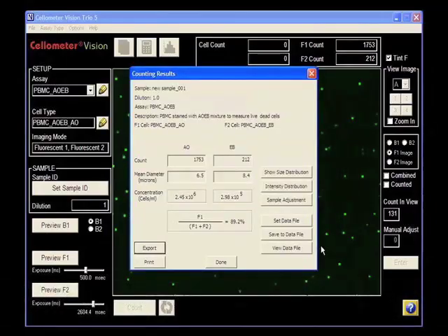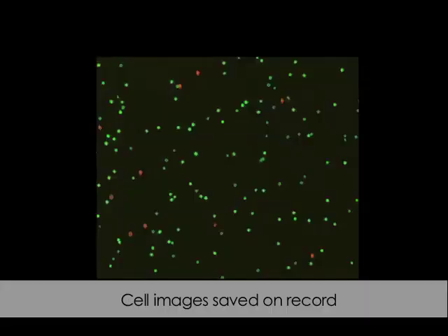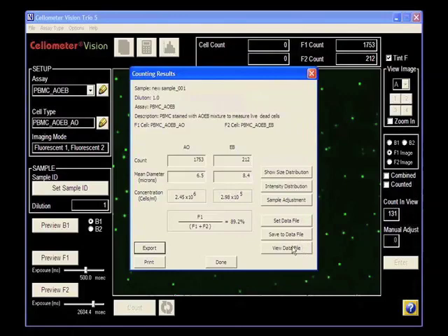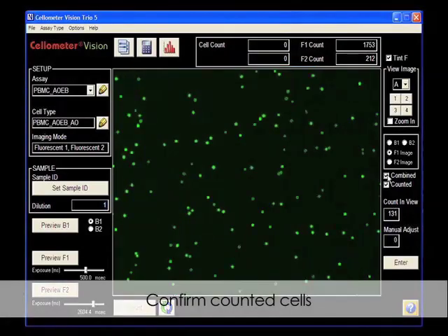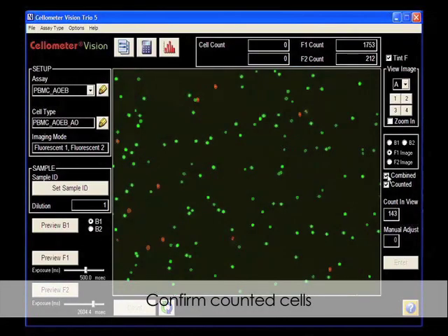Cell images are saved as a record for each sample. They can also be used to reanalyze your data. Counted cells are outlined in green for live cells and red for dead cells.